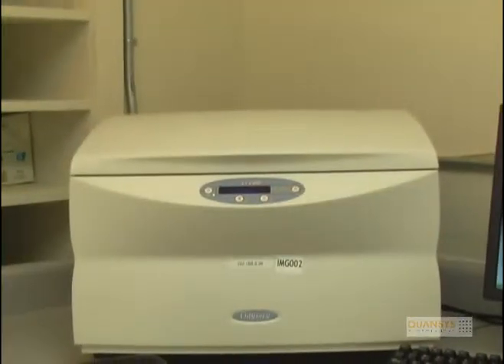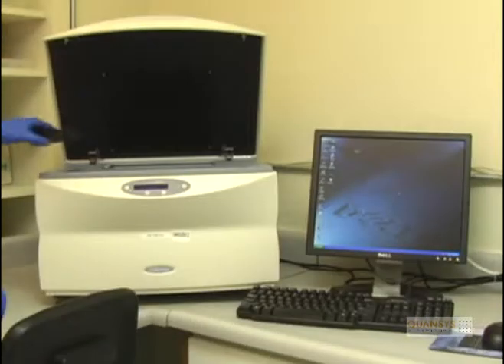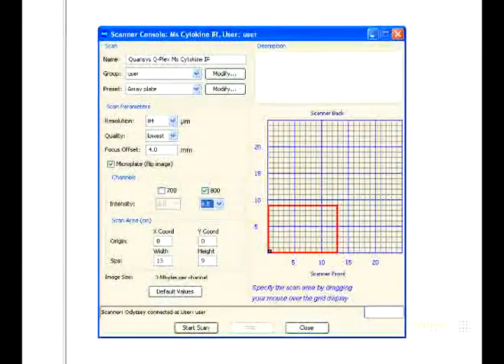Gently clean the bottom of the plate and the scanner with 70% ethanol and a Kim wipe. Place the plate on the front left corner of the scanning bed and close the door. Press scan in the software when you are ready to scan the plate.